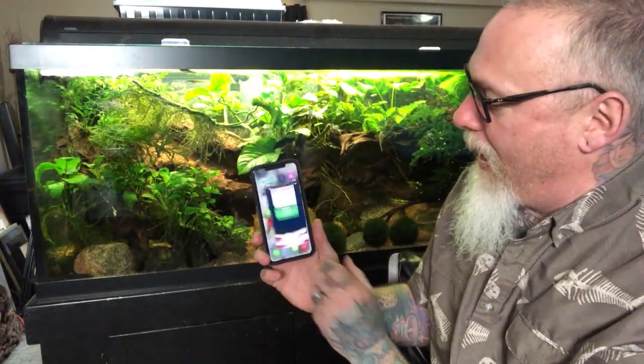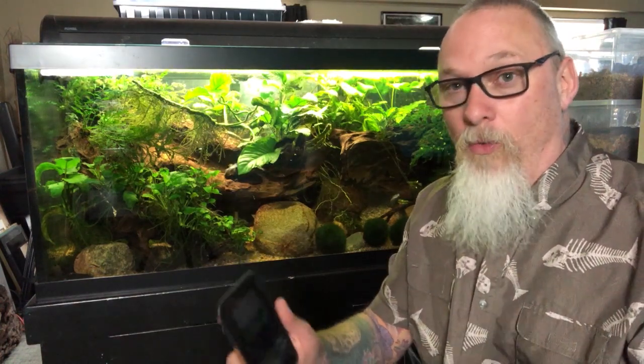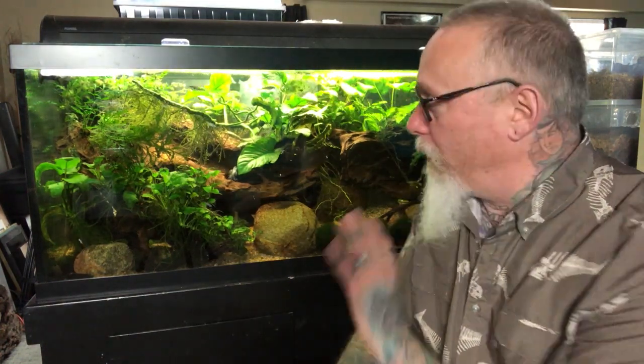I've already taken the liberty of downloading the app. When you first open the app, you have a couple of options. The first option is 'My Analysis,' which scans, saves, and compares. If you were to test this aquarium once a month, you could tabulate your results, maintain them, and watch a trend to see how things go. Because when it comes to water quality, fish in the wild — unless from a blackwater swamp with no circulation — do not deal with all the buildups that fish in an aquarium would. Once a week or once a month we do a partial water change, and that is drastic in regards to water chemistry. Very, very drastic.